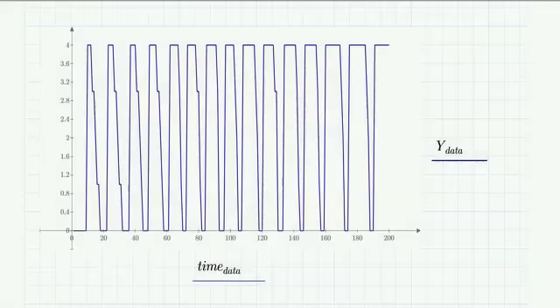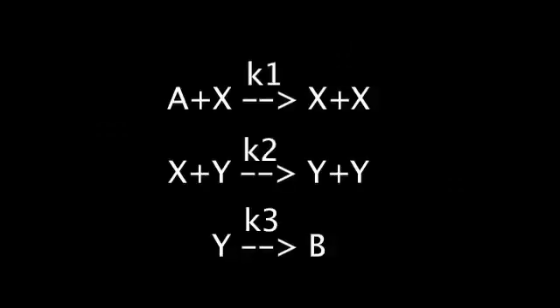This is our plot of the reaction data for the black species. It was digitized using the same convention as the yellow species. It should be noted that this convention produced a curve that is inverse in relation to the theoretical mechanism curve for this species. Shown here is the reaction mechanism used to simulate the reaction observed in the experiment. By modifying the rate constants, we were able to fit our theoretical mechanism to the experimental data.